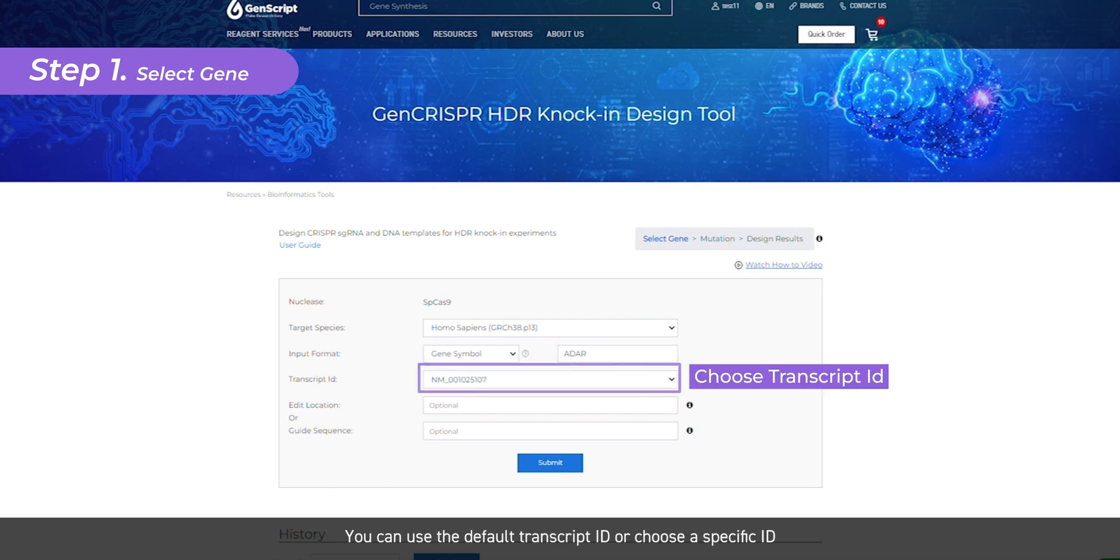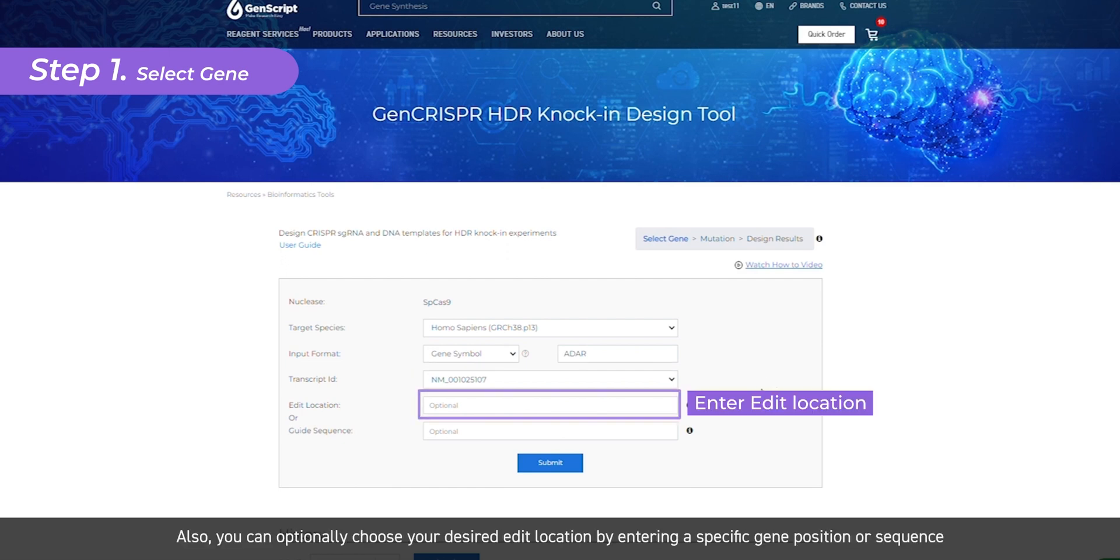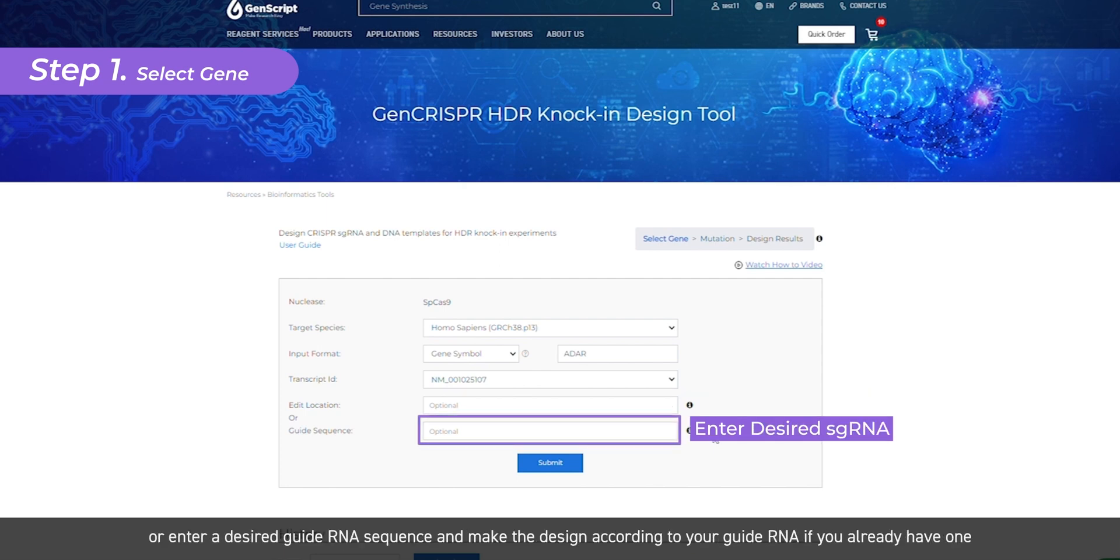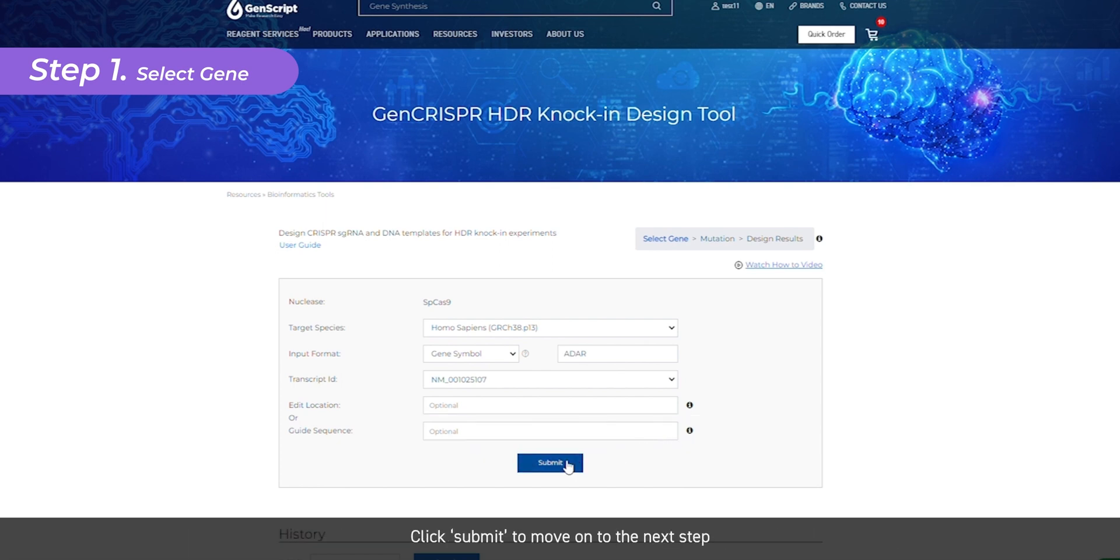You can use the default transcript ID or choose a specific ID. You can optionally choose your desired edit location by entering a specific gene position or sequence, or enter a desired guide RNA sequence and make the design according to your guide RNA if you already have one. Click Submit to move on to the next step.